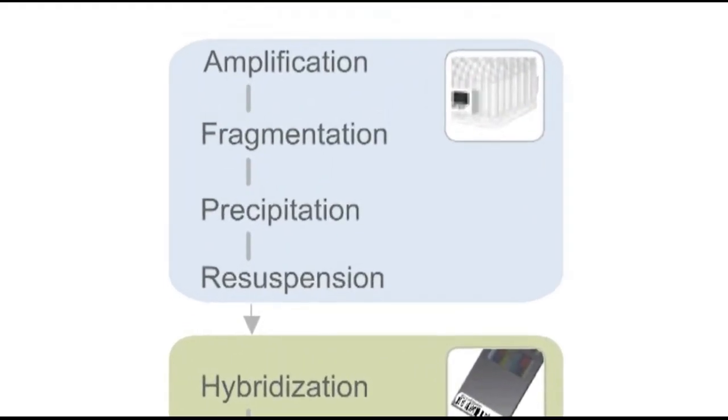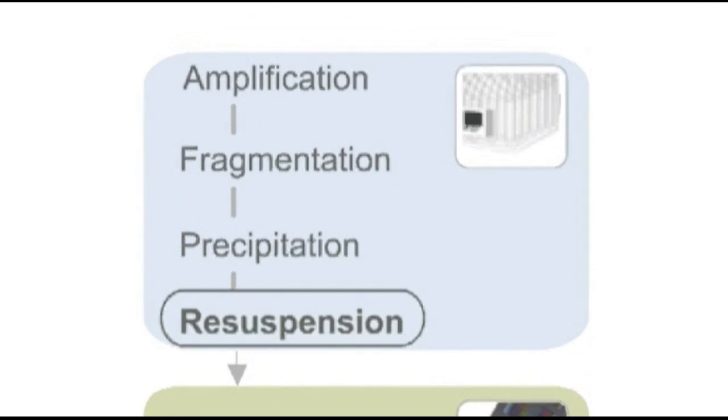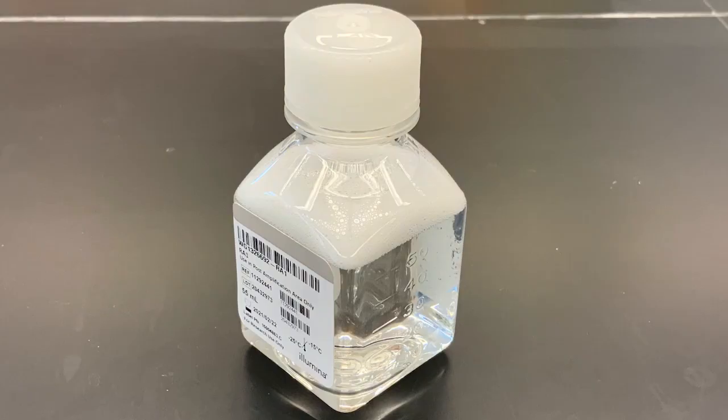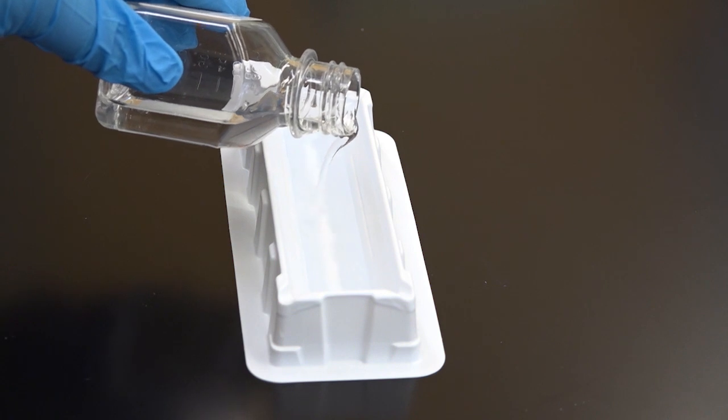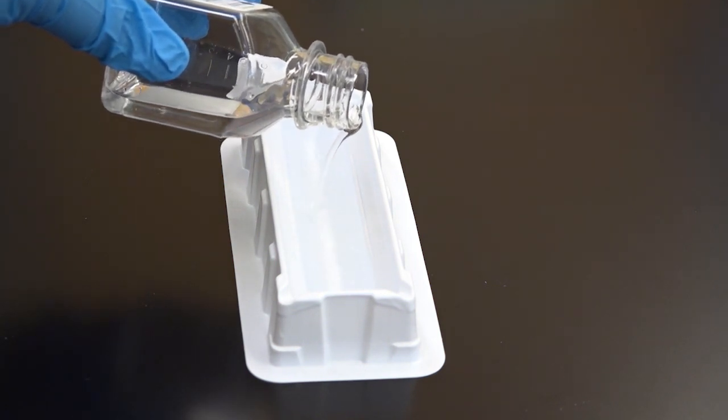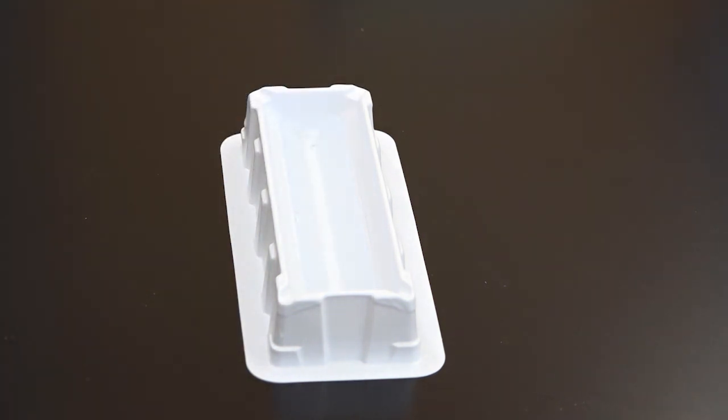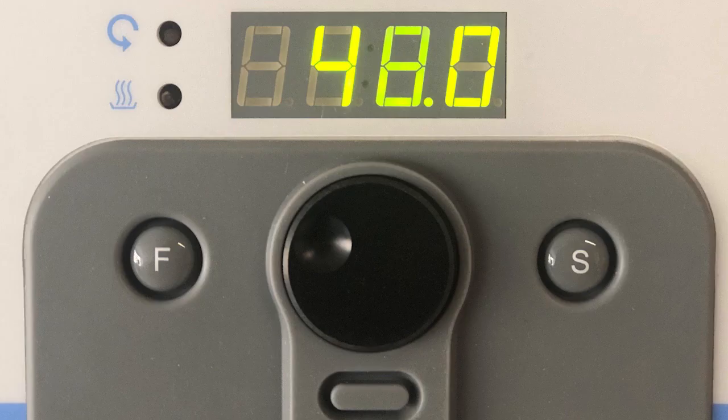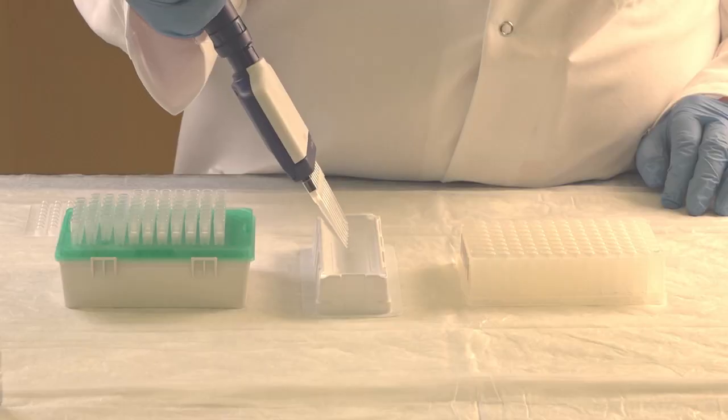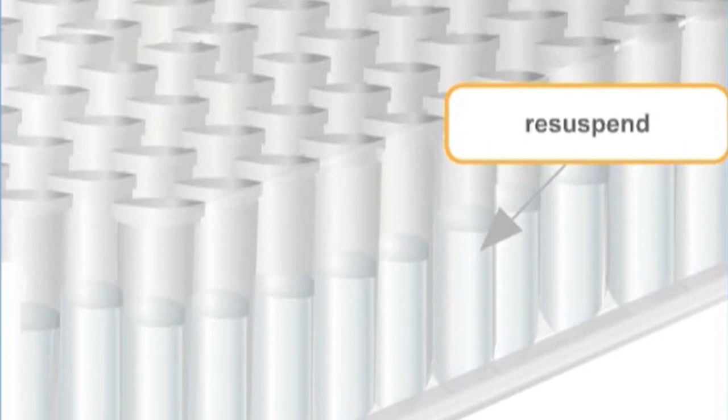The next step in the Infinium assay is resuspension. It is important to dispense fresh resuspension reagent each time for the resuspension step. Pour the resuspension reagent into a disposable trough. Set the hybridization oven to 48 degrees Celsius. After the pellet has been allowed to dry, it is resuspended in hybridization buffer. This buffer provides ideal conditions for the next step, hybridization to the bead chip.